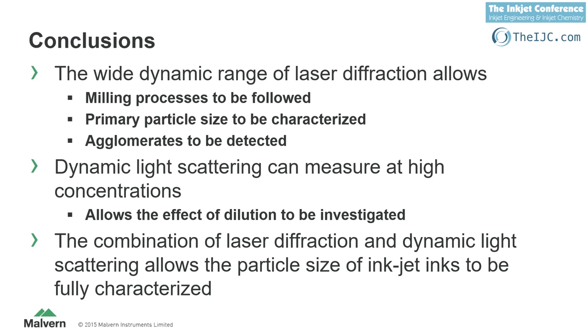That brings me to the conclusions for this presentation. In terms of the two techniques that I've talked about, the wide range of laser diffraction allows us to do things like following milling processes from the premix to the final particle size, characterize that final particle size and easily detect agglomerates in a pigment dispersion.